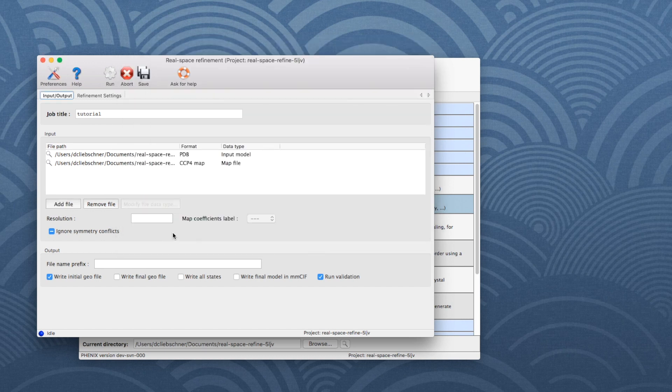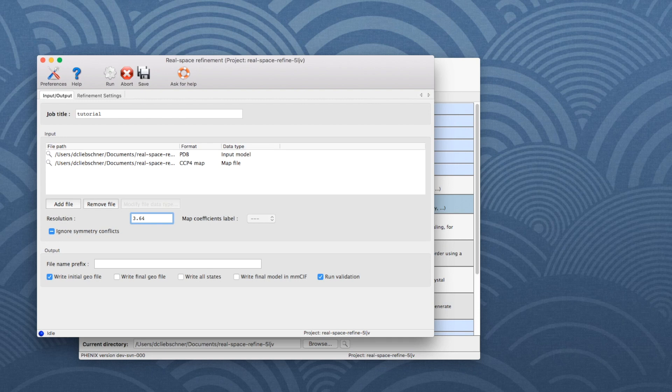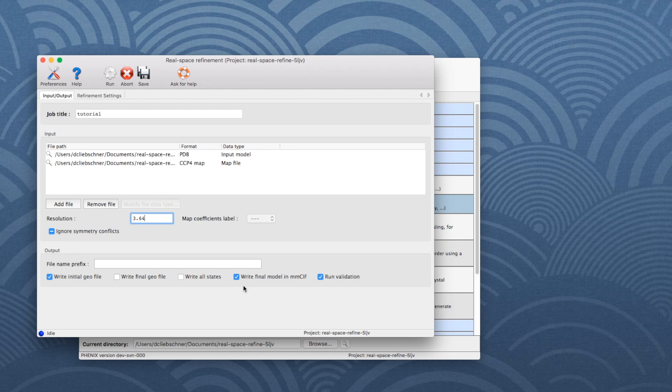As we use a map file, we have to input the resolution, which is 3.64 for this example dataset. If the output model file should be written in MMCIF format, check the corresponding box.